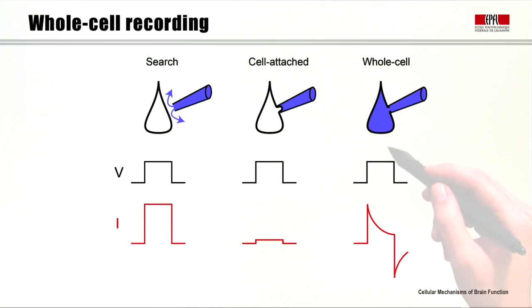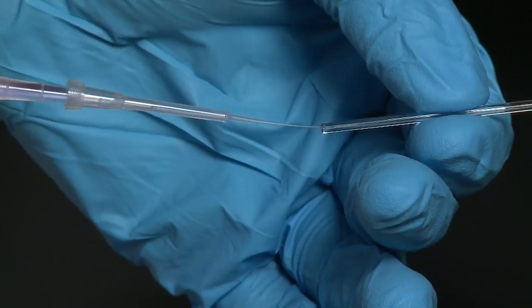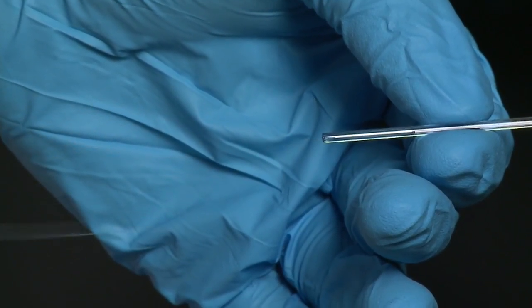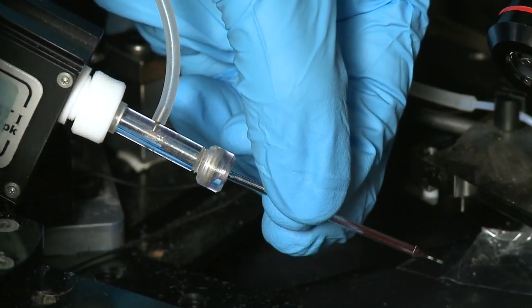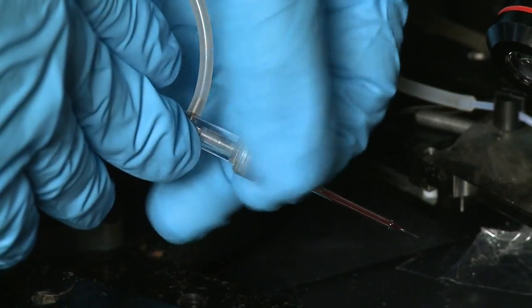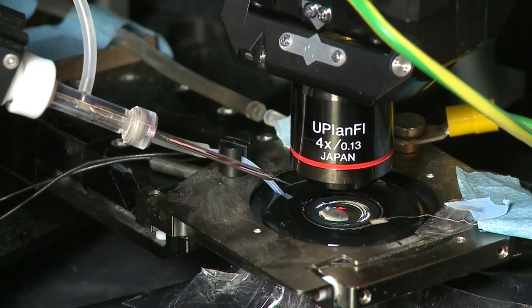When we break the membrane, we see a current flow charging the membrane because of the cell capacitance. We fill our glass pipette with internal solution and place it on the head stage, which has the silver chloride recording electrode on it. The reason the internal solution looks purple is that it contains a red fluorophore called Alexa 594 to allow fluorescence imaging. Before we move the pipette into the ACSF bath solution, we apply positive pressure to keep the tip clean by always having an outward flow of solution.